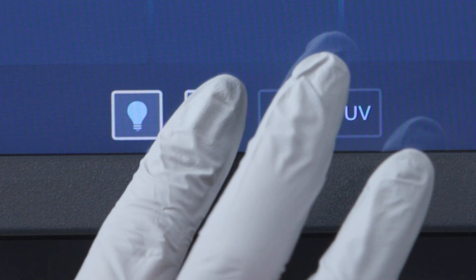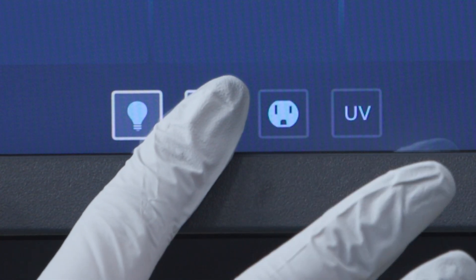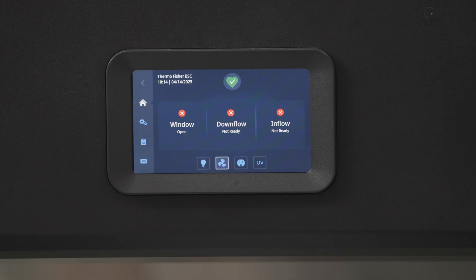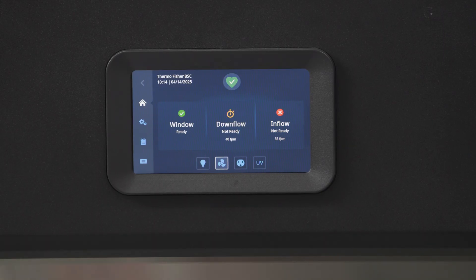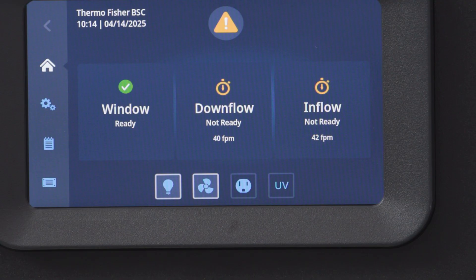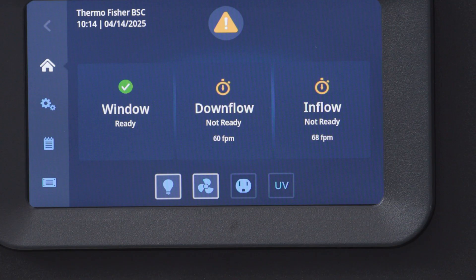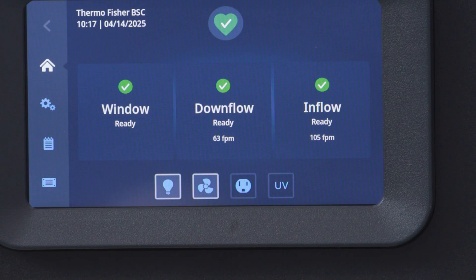Did you notice that when we turned on the fan the display changed? The downflow and inflow icon went from off to not ready. After the fan has had enough time to establish the airflows, the not ready icon turns to ready and the average inflow and downflow velocities are displayed.